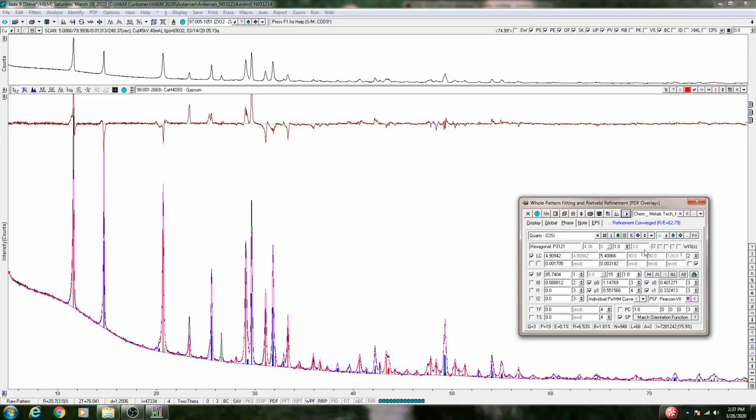All right, what the round numbers are, if you look on the sides of some of these parameters, you'll see a round assignment. So that's the second round. This is done in the third round. What that means is it's actually doing the refinement in steps. If it converges in the first round of something, it'll converge and stop, and it won't even refine the lattice constants, or in this particular case, skewness, or Lorentz and the polarization factors, all right? So it starts with the obvious things, and then works to the deeper things.